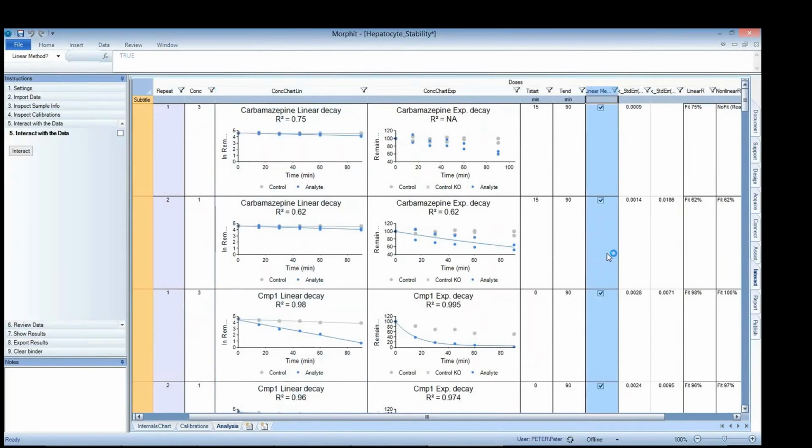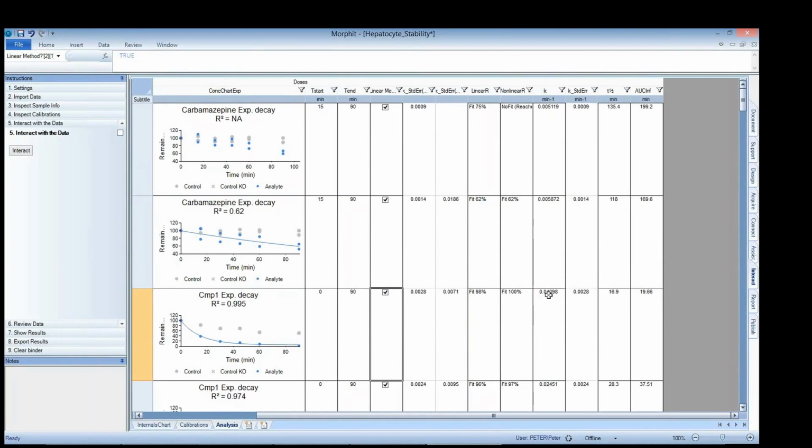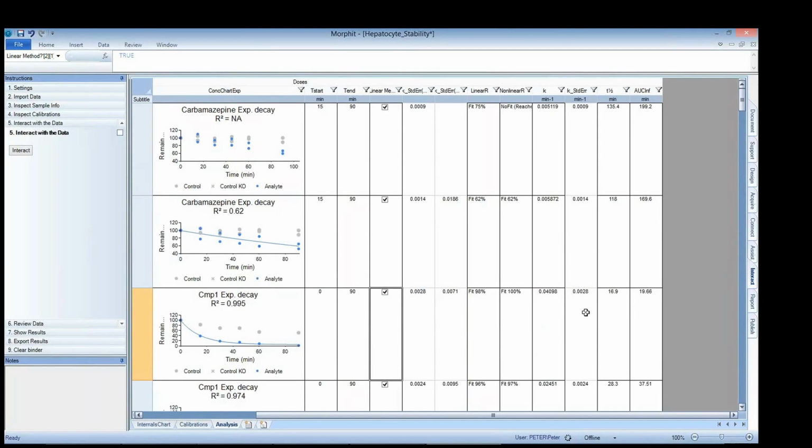And we have built in this tick box for that. So if I click this tick box, then it will automatically select this model. And as you see, while I am clicking this, you will see these values changing. You see? So it's slightly changing here from 0.04 to 0.06, so it affects your data. Of course, if you came to a conclusion that this is the only method your lab will support, then we will just get rid of this one for you. It's just disabling it or taking it out completely.